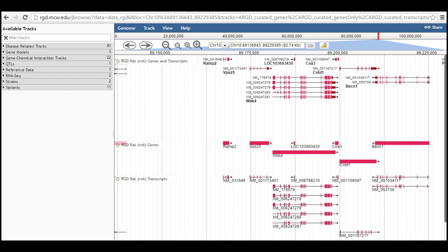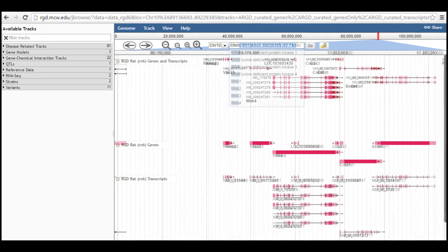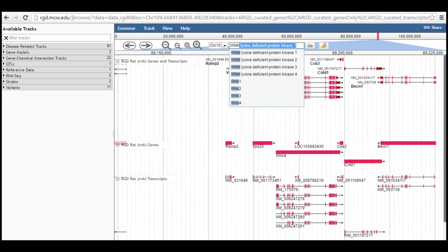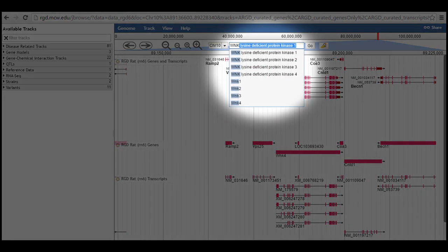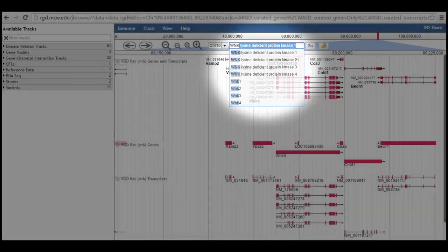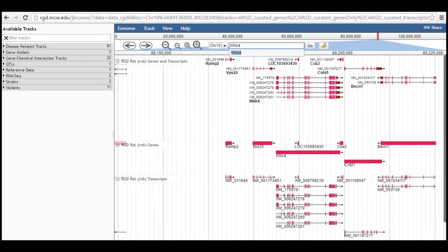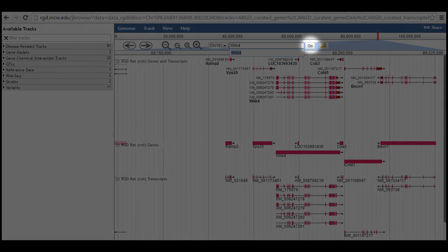When you start typing, for example, entering WNK into the box, it brings up a list of possible matches for your search. Select the last item in the list, WNK4, and click go to navigate to that region of the genome.